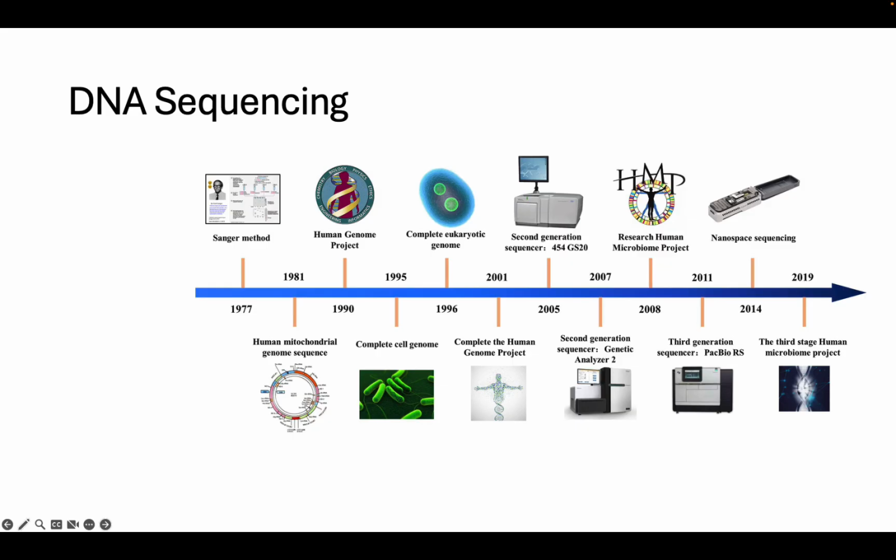The first method for doing DNA sequencing is called Sanger sequencing or dideoxy chain termination sequencing. This first was available in 1977. It was created by a scientist named Fred Sanger, who ended up winning a Nobel Prize for it.